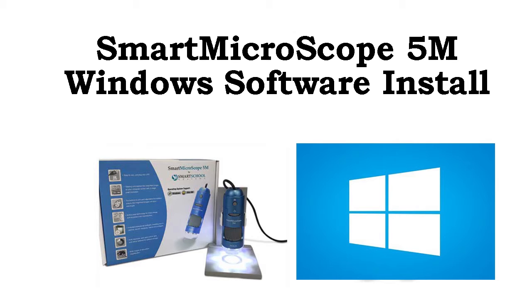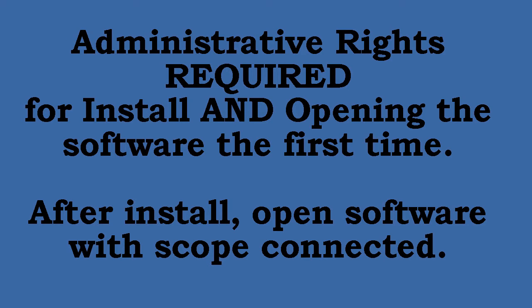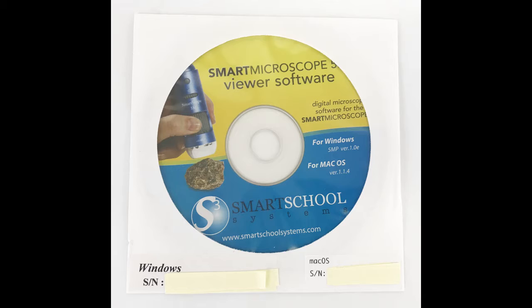SmartMicroScope 5M Windows software install. In order to install the software on a Windows machine, you must have full administrative rights. You will also need that when you open the software the first time. So once it's installed, plug the scope in and open the software.